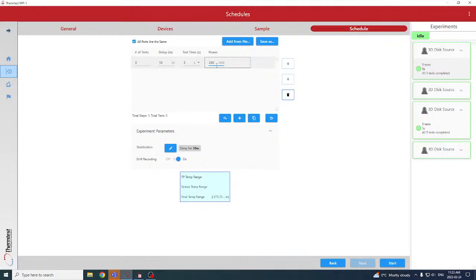Those parameters are suggested by the ITPS to achieve our minimum temperature rise and our probing depth. So we want our heat to stay within the dimensions of the sample. The anisotropic samples have another layer of slightly more complexity because now we have 2 directions of penetration. We have through the thickness and in plane. We want to make sure we're staying within the dimensions of the sample. And then we're going to have a 10-minute delay before that first measurement.